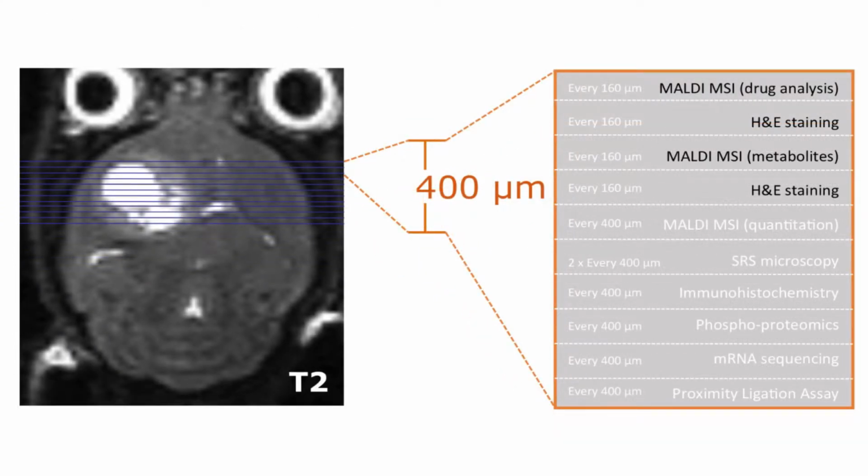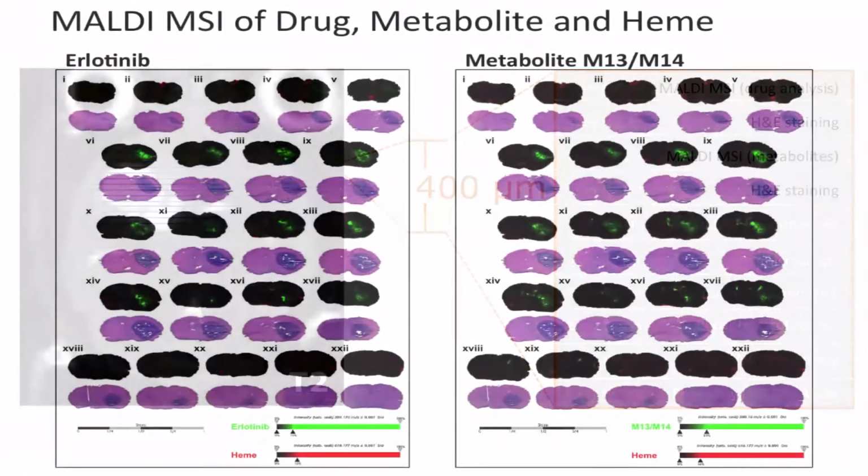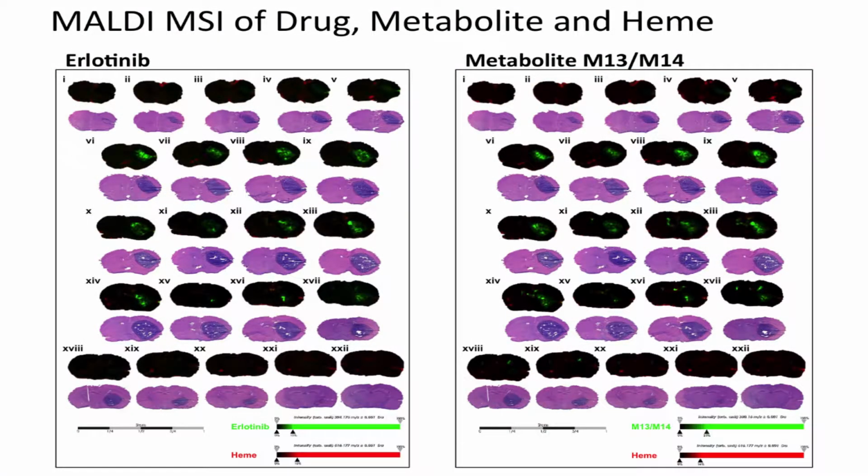So the first part that I'll be talking about is to look at the drug analysis as it relates to H&E stain and look at the distribution of some biomarkers with mass spectrometry imaging. So 1 animal per, and I might make it look a little easy here. They're not exactly just pictures.